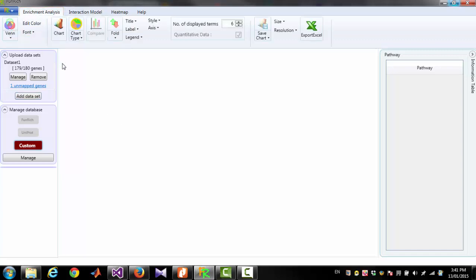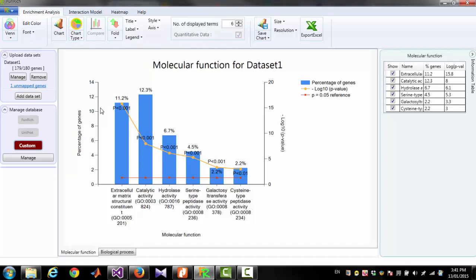Now to perform enrichment analysis, you have to click on 'Chart.' This will show you the graph for molecular function, and you can also find the chart for biological process on the next tab.